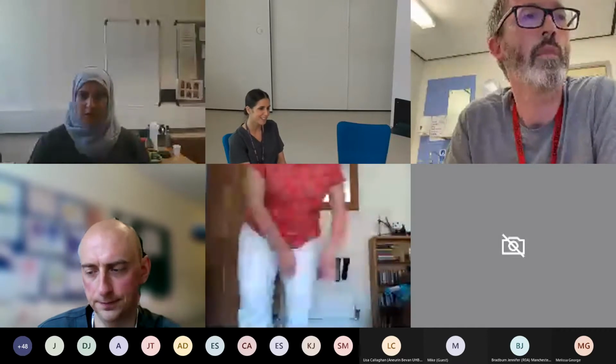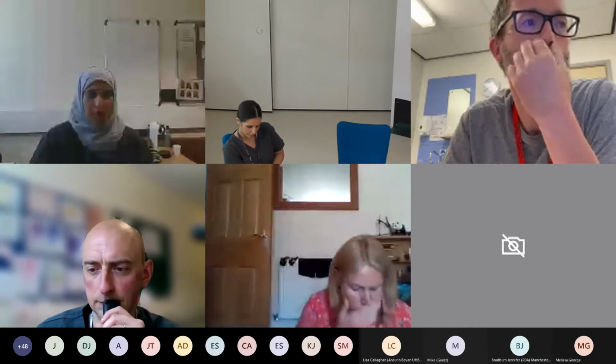There's also a question from Tracy Stevenson. Do all of your BMS staff pre-report the cytology? It's only the BMS staff, we do the internal quality control, where we're looking at the technical quality of the slide, and that's looking at the staining of the slide. It's not a prerequisite that we're pre-screening the slides, but the BMS do, as a CPD, look at the actual slides, especially if they've attended the FNA for that patient. So they've seen the sample being taken, they've prepared the sample, and then they've actually had a look at the cells that have come from that patient.